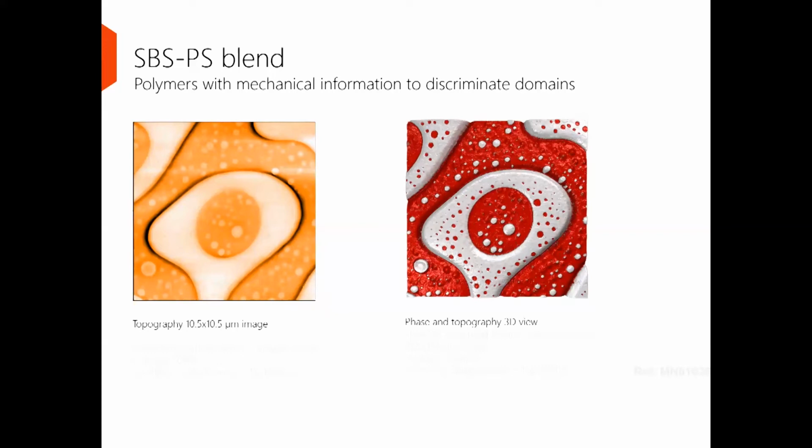So you can see this is a bit of a fractal surface where we have large bubbles and smaller bubbles. And if we zoom in, this pattern tends to repeat itself all the way down to the polymeric chain level.